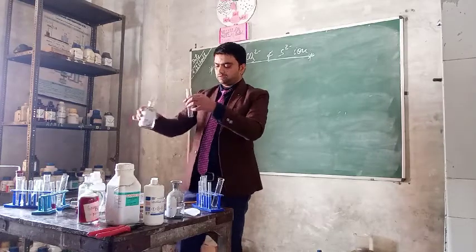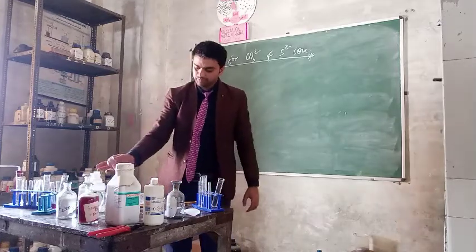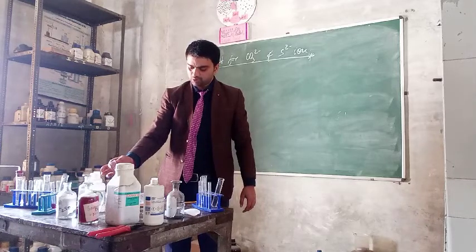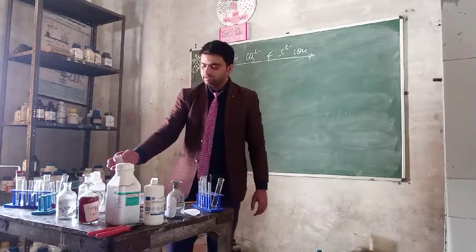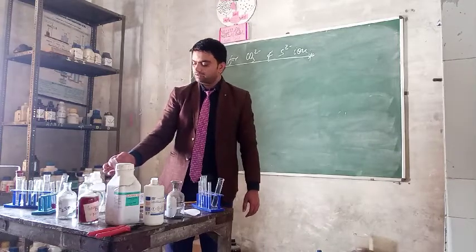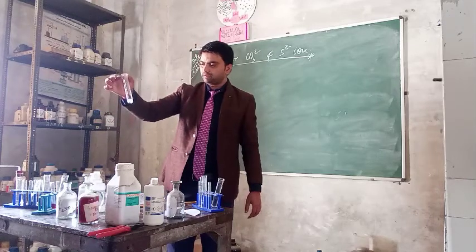This is the dilute H2SO4. The reaction is not started, so you have to heat the mixture. And after that we observe the rotten egg like smell. If you observe the rotten egg like smell inside the test tube or the boiling tube, then you will say that your salt has sulphide ion. So you can see here the reaction has started.